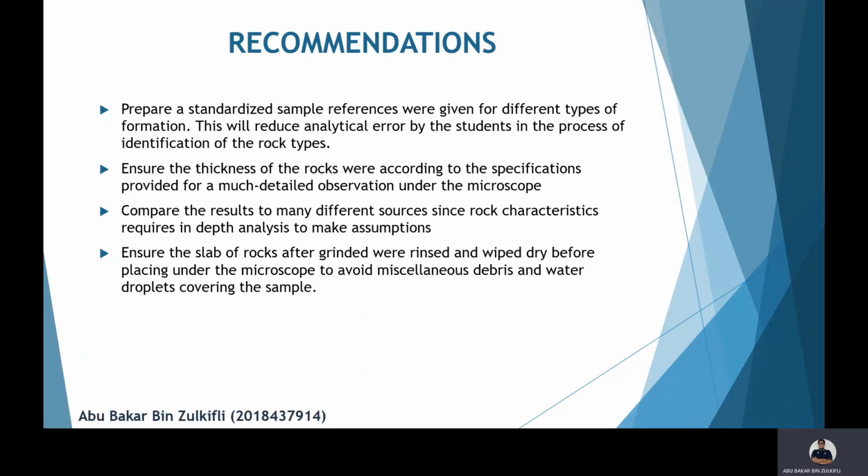Next, we need to compare the results to many different sources, since rock characteristics require in-depth analysis to make assumptions. Last but not least, it is to ensure that the slabs of rocks, after being ground, are rinsed and wiped dry before placing under the microscope to avoid miscellaneous debris and water droplets covering the sample.